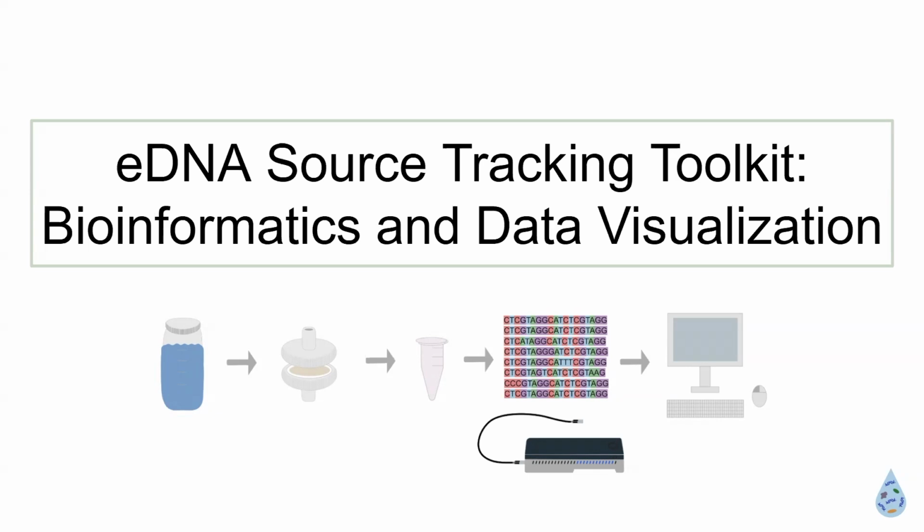But just to say that not all hope is ever lost, I have gotten RNA samples that have been in a chest freezer for 20, 25 years. I will never throw the baby out with the bathwater. There's ideal, and then there's we're going to get it done, and we're going to see what we see. So I'm just going to give you the ideal and the best practices. And then of course, never just throw something out because you think it hasn't been stored perfectly.